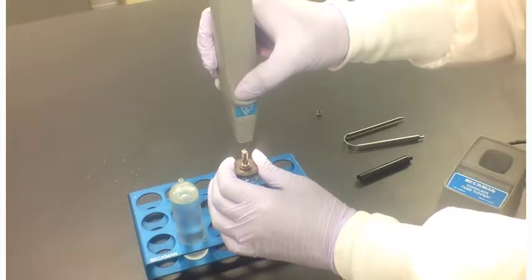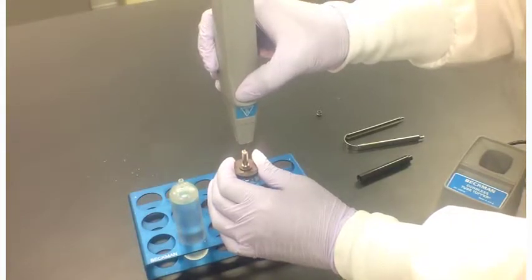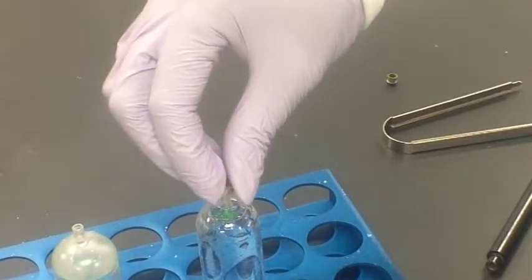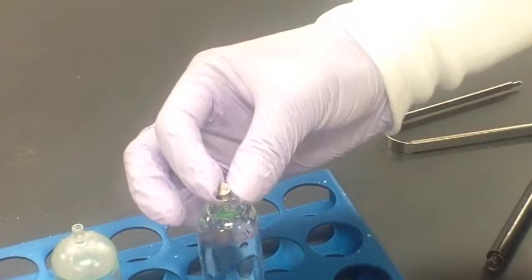Apply the tip of the tube topper vertically to the seal former. Press down gently for about 10 seconds. The seal guide should move down the tube stem until it rests on the tube shoulder.